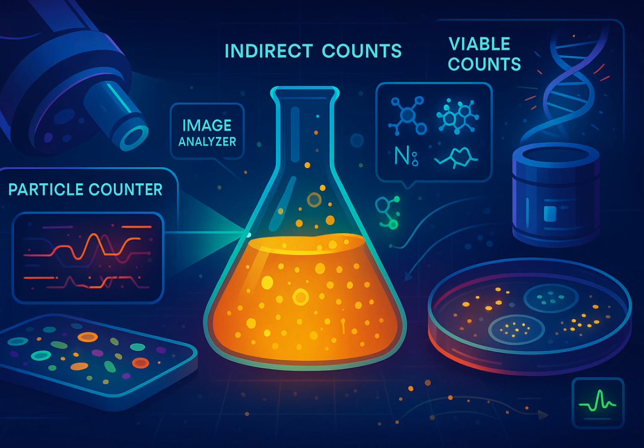It also gives you a number. It gives you a quantity of target DNA, yes. It's much faster, often under an hour, no gels needed. Multiplex PCR lets you look for several different targets at once. Sounds amazing. Sensitive, specific, fast. It is all those things.